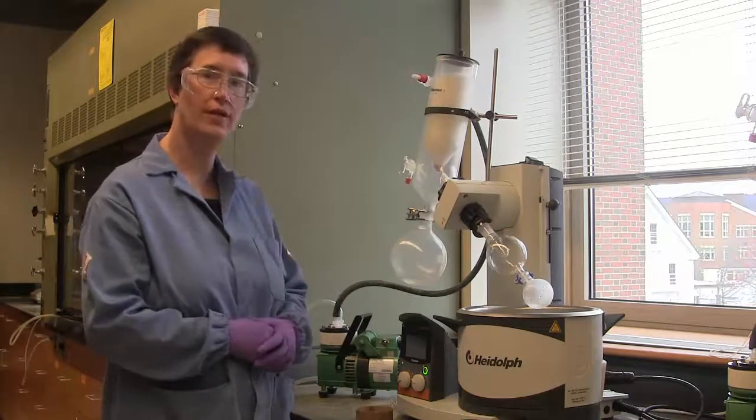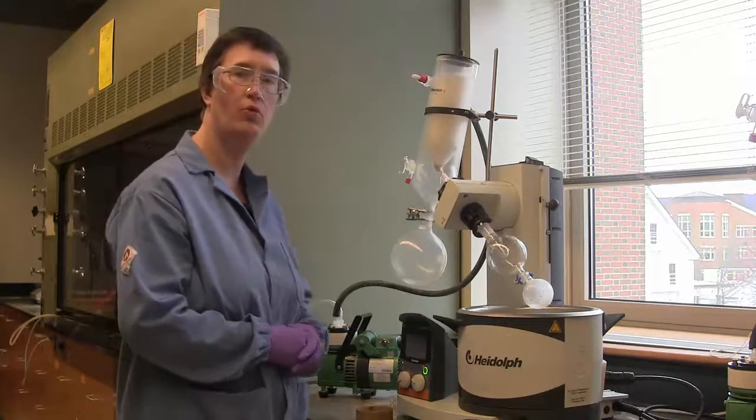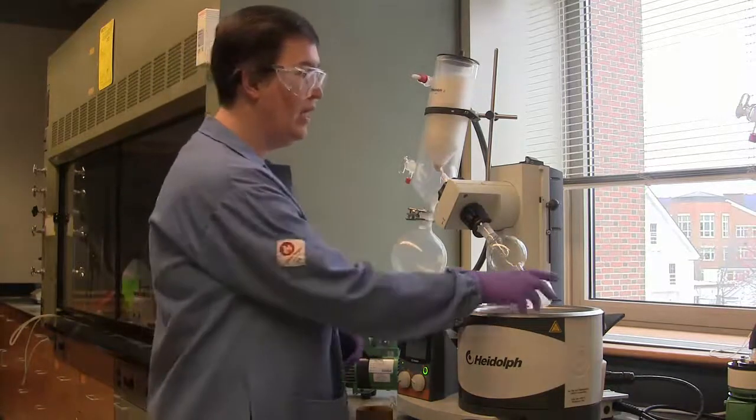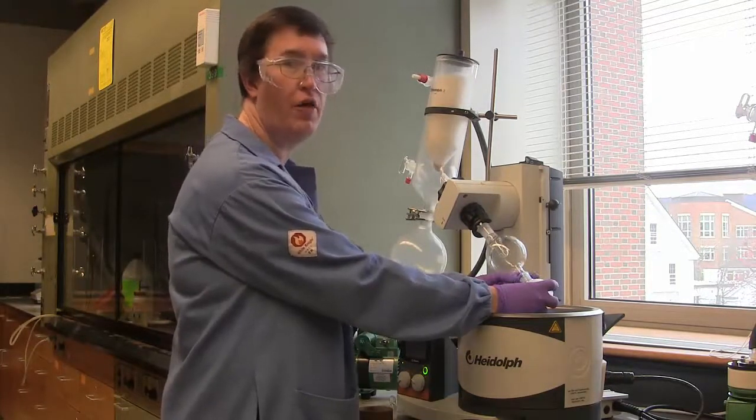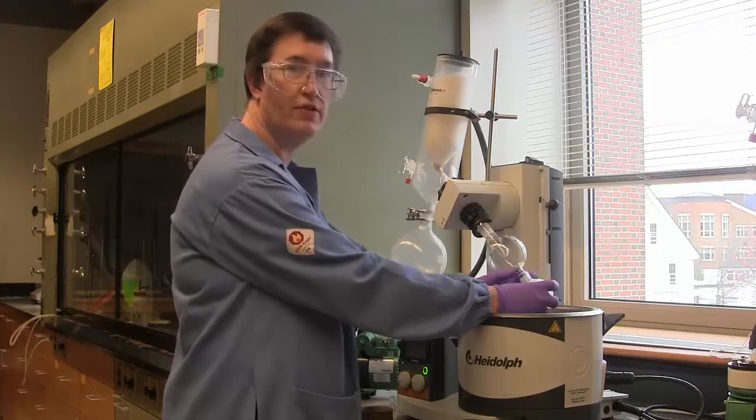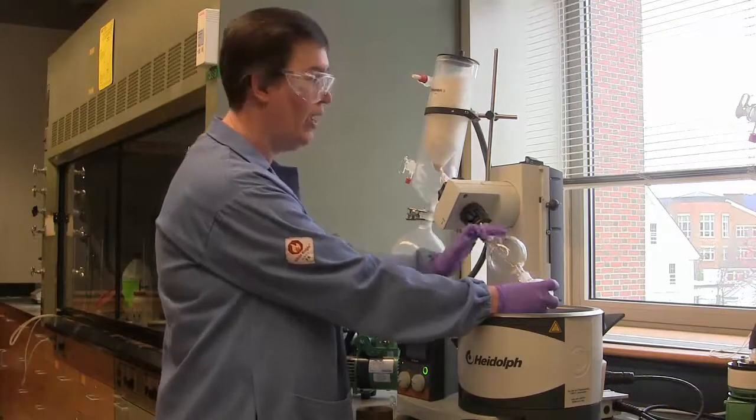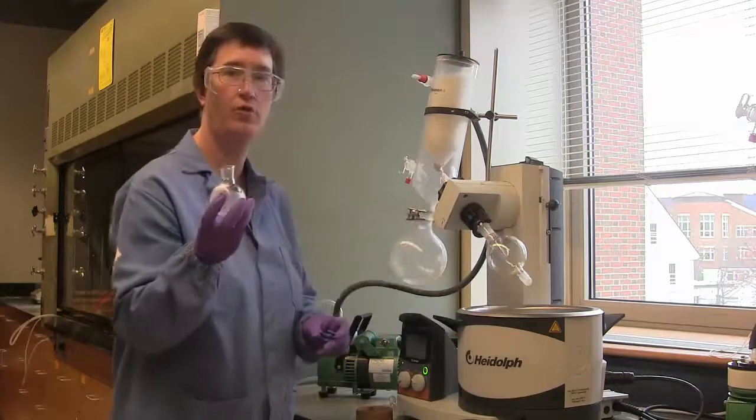Once the pressure has equilibrated to atmospheric pressure, I can then remove the round bottom flask. I simply hold the flask with one hand, and I pull the Keck clip off with the other. It's best to grab both sides of the Keck clip and pull away, and then remove the round bottom flask.